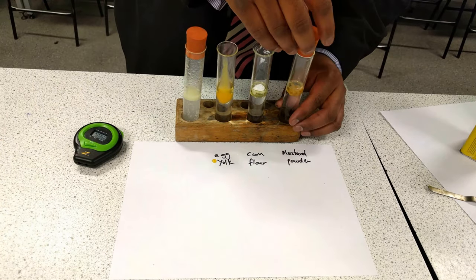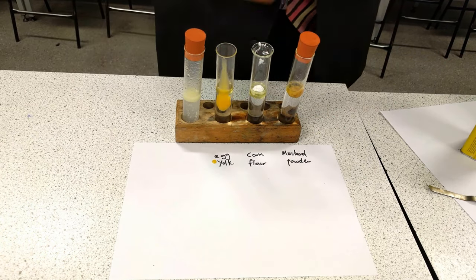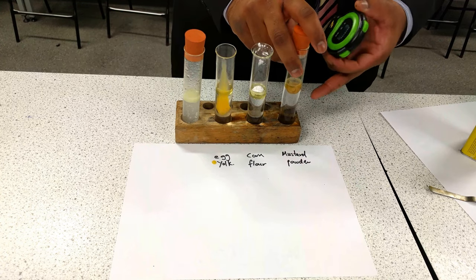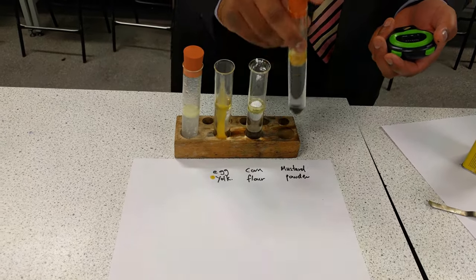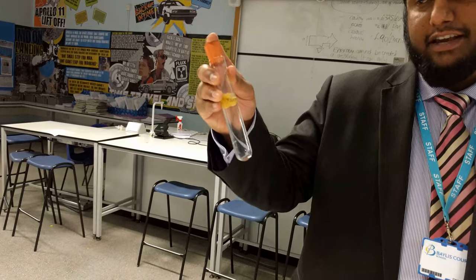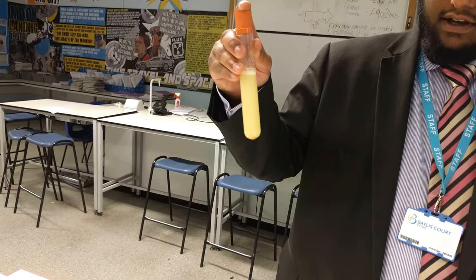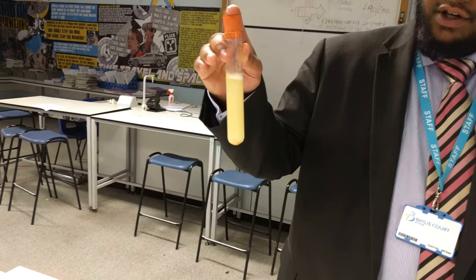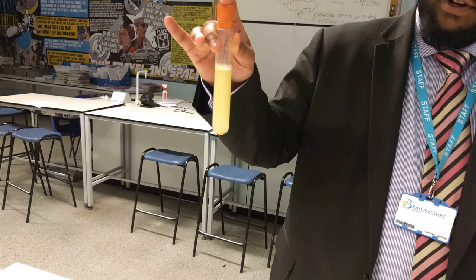I'm going to put a rubber bung on the mustard powder tube. And then as soon as I start shaking it, and as soon as I'm happy with the emulsion that's been formed, I am then going to start the timer and see how long it takes for separation. So for mustard powder, oil and water, I need to shake it the same amount of time — I'm going to give it about 10 shakes. And I start my stopwatch, and we are going to look at how long it takes for the oil to separate from the water.